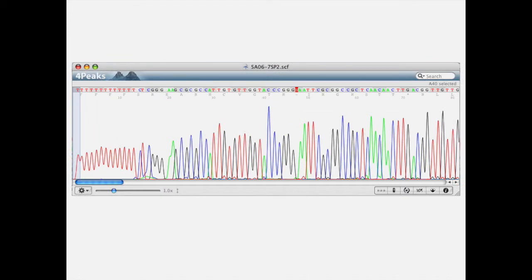Okay, so when we send out our samples for sequencing, we receive a file from Rutgers in this format. This is actually a waveform file shown in a program called 4Peaks. That's only a Mac-based program. We use a program called Finch, and you'll be looking at these in school in Finch. So let's take a look at what this actually means and how we analyze it.